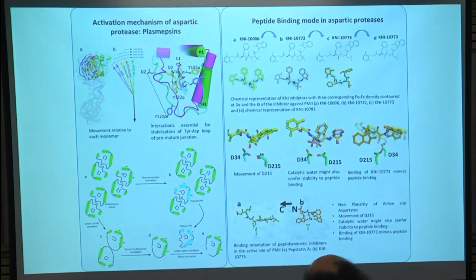And when we superpose all the dimers, we see that there is actually a movement in one of the dimers. To understand what this movement was related to, we look at the structure and see that this particular region at the dimer interface has an interaction which, if it gets disrupted, causes a huge change in the movement of these dimers.